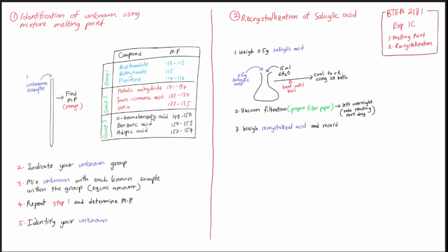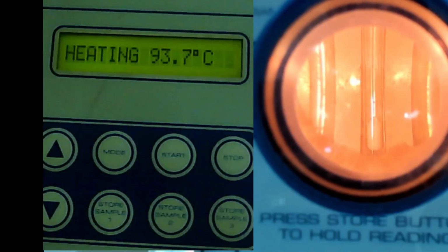For that purpose, you need to start your plateau lower. But for this experiment, it's okay because you already know all your samples are from these 9 entities. Okay, so let's go back to this.